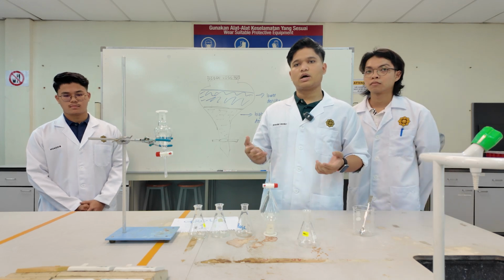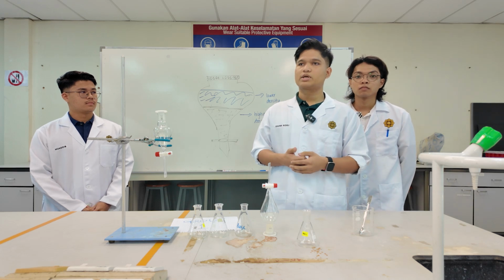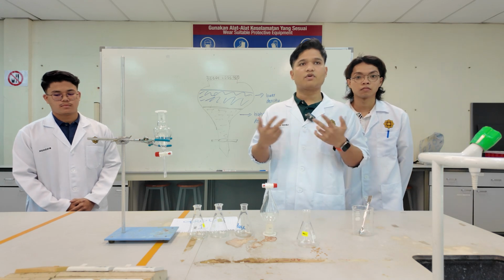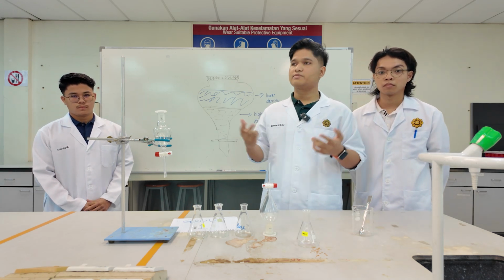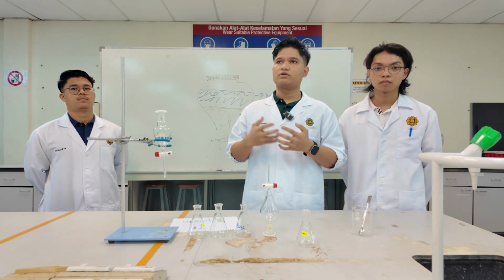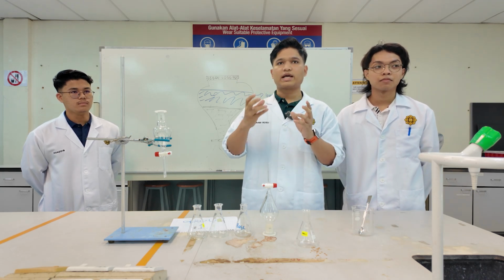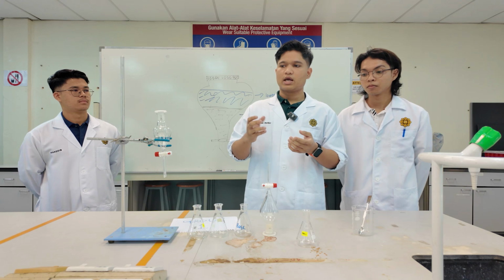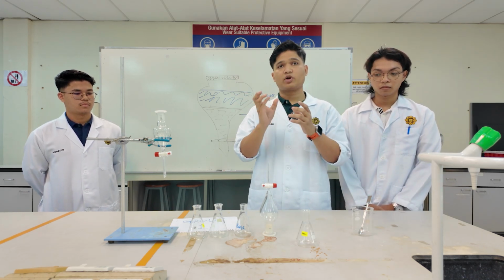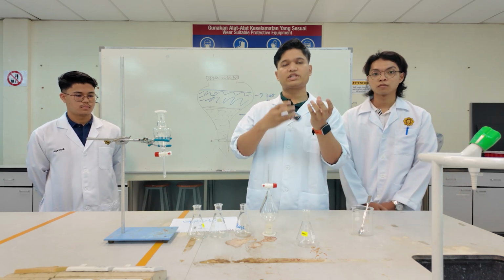So as we know, this method is commonly used in petrochemicals, in pharmaceuticals, and many more that involve separating organic compounds from their mixture. So for the problem statement, as everyone knows, organic compounds don't occur in their pure form. So we need to extract them from a natural resource and from mixtures, which contain impurities. These impurities we don't want, and we want the pure substance.